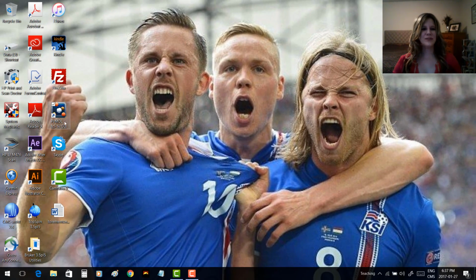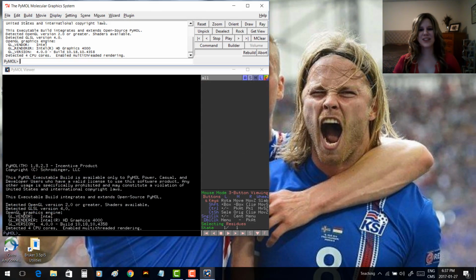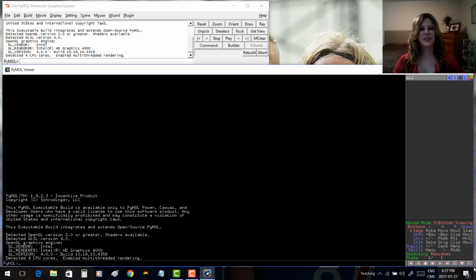Hopefully you joined us for the first two videos, the introduction and looking at labels. Today we'll be looking at measurements. So let's go ahead and launch our PyMOL. And again, we'll be looking at our same familiar protein, 1RGS.